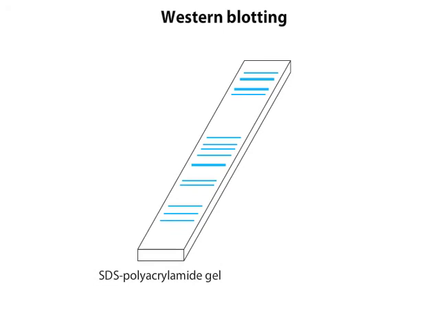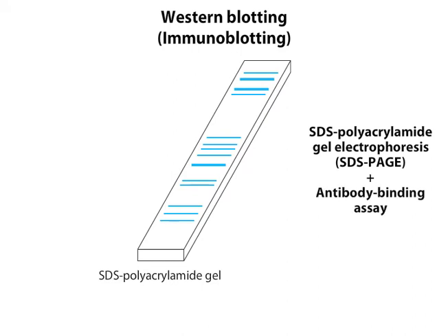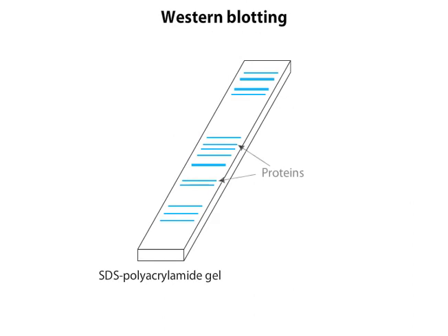Western blotting, also known as immunoblotting, combines the superior resolving power of SDS polyacrylamide gel electrophoresis, or SDS-PAGE, with a highly sensitive antibody binding assay to detect a specific protein in a mixture of proteins. Proteins are first separated by size, by SDS-PAGE. Detecting a specific protein by SDS-PAGE alone is usually not possible. Western blotting provides the sensitivity to detect a specific protein.